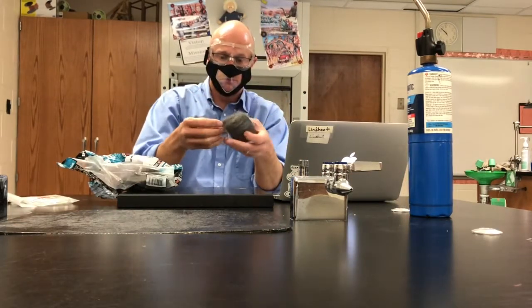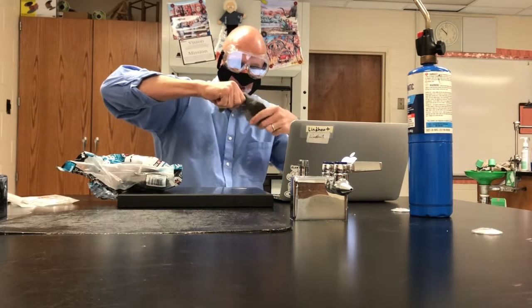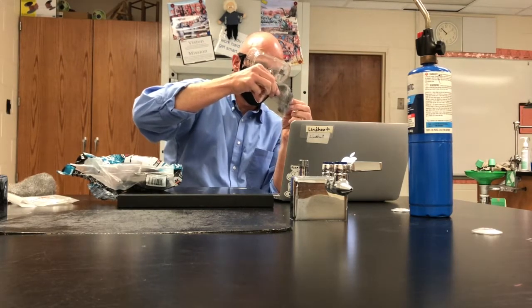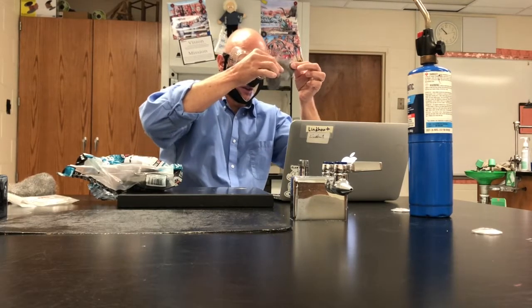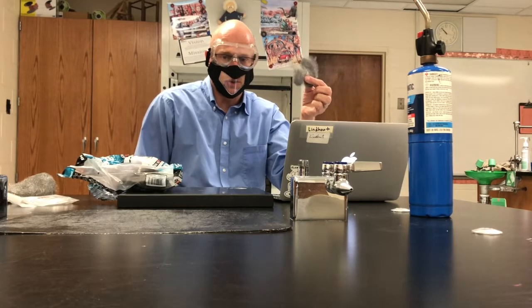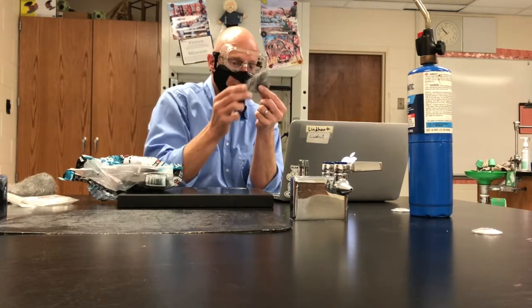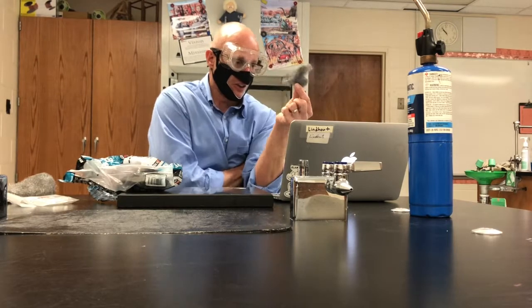Steel wool. And what I'm going to do with the steel wool is I'm just going to stretch it out. When I stretch it out, am I changing the particles, do you think? Stretching it out or balling it up, that's really just a physical change. Steel wool is made mainly of iron. So let's just think of this as iron.